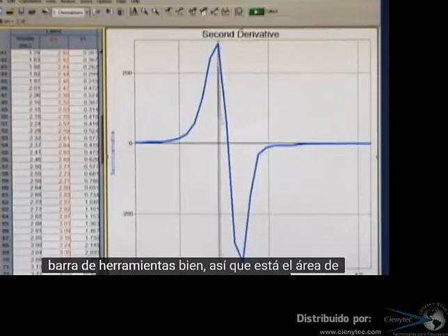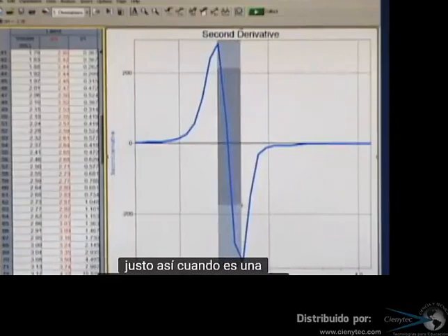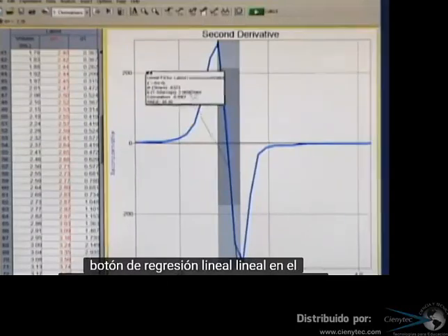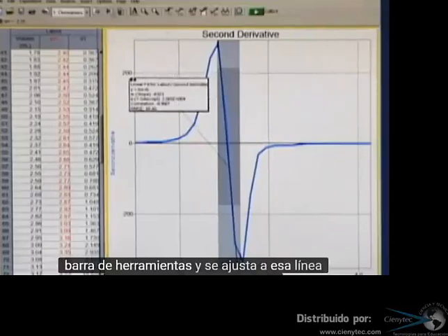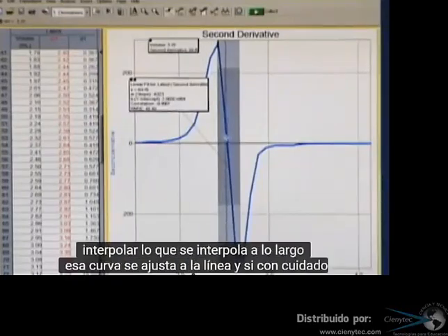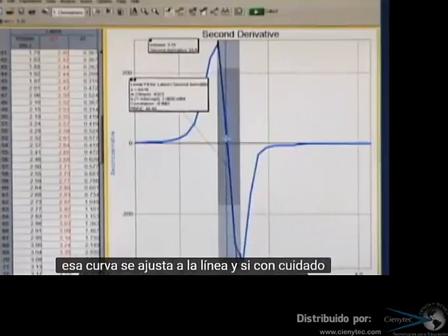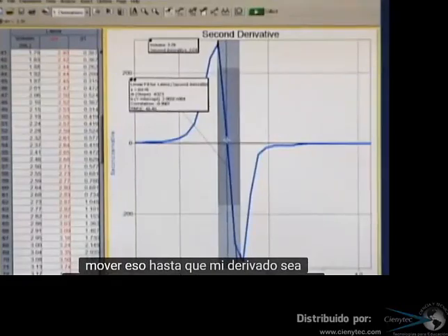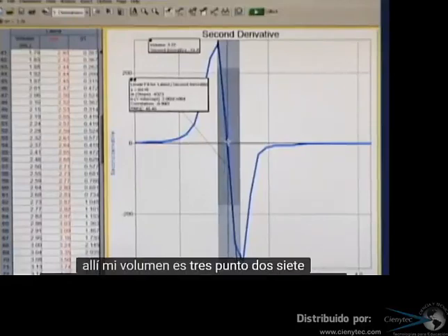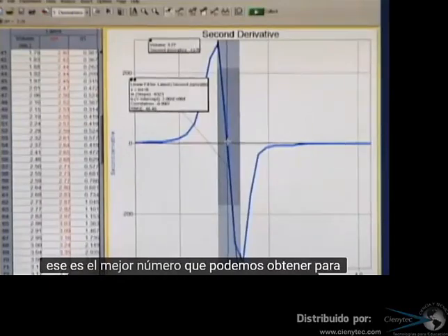If I select a region right about like that where it is a linear curve right along where it crosses 0, I can then click on the linear regression button on the toolbar, and it fits a line to that section. I then go to Analyze and Interpolate, which will interpolate along that curve fit line. And if I carefully move that around until my derivative is as close to 0 as I can get it, right there, my volume is 3.27. That is the best number we can get for the equivalence point of that titration.